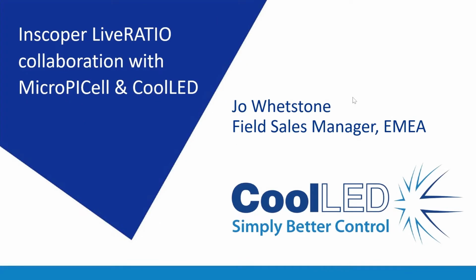Hello, this is Joe Whetstone, the Field Sales Manager for CoolLED, looking after Europe, Middle East and Africa. I am delighted to be here to speak to you regarding our collaboration with INSCOPER using our pE-800 fura illumination system at the Micro PI Cell Imaging Centre in Nantes.